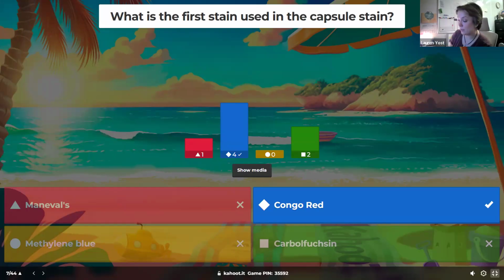So I feel like if you only got four differential stains that you need to know, and one of them is the endospore stain, and I'm telling you that it is a pure culture and telling you that it's not a pleomorphic bacteria, it can't change its shape. Even a pleomorphic bacteria, you're not going to have rods and circles. You're going to have all these different shapes all over the place, and they're not going to be very clearly defined either way. So if I'm telling you it's a pure culture and not pleomorphic and you see rods and circles in there, that should tell you already that this is an endospore forming bacteria.